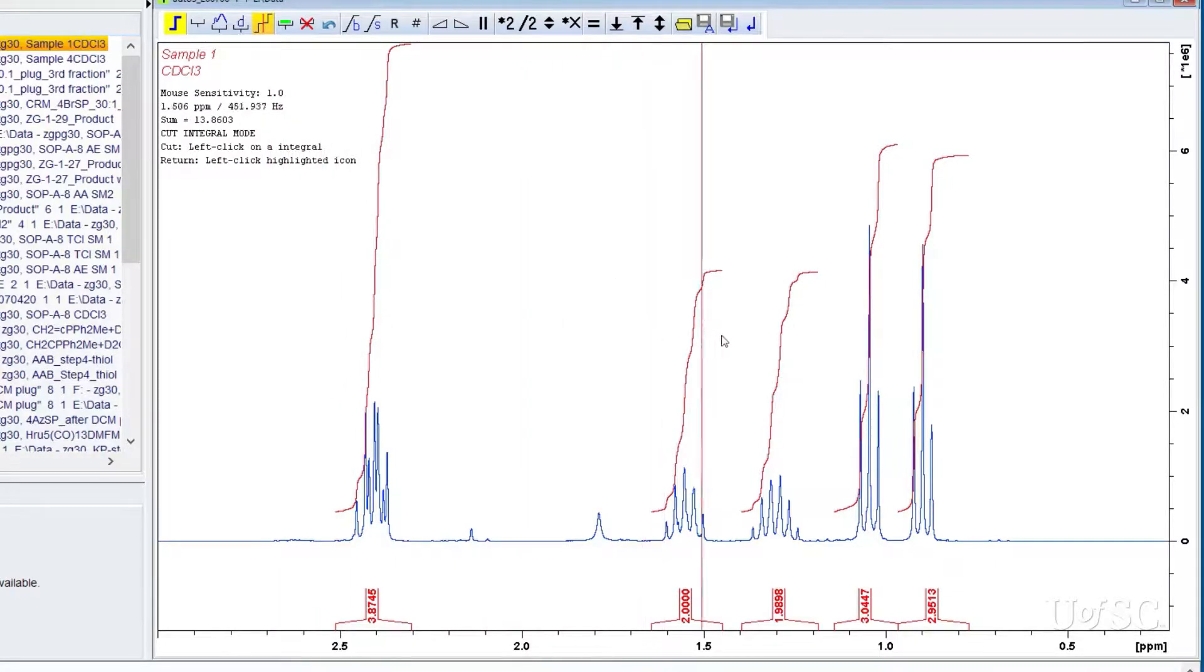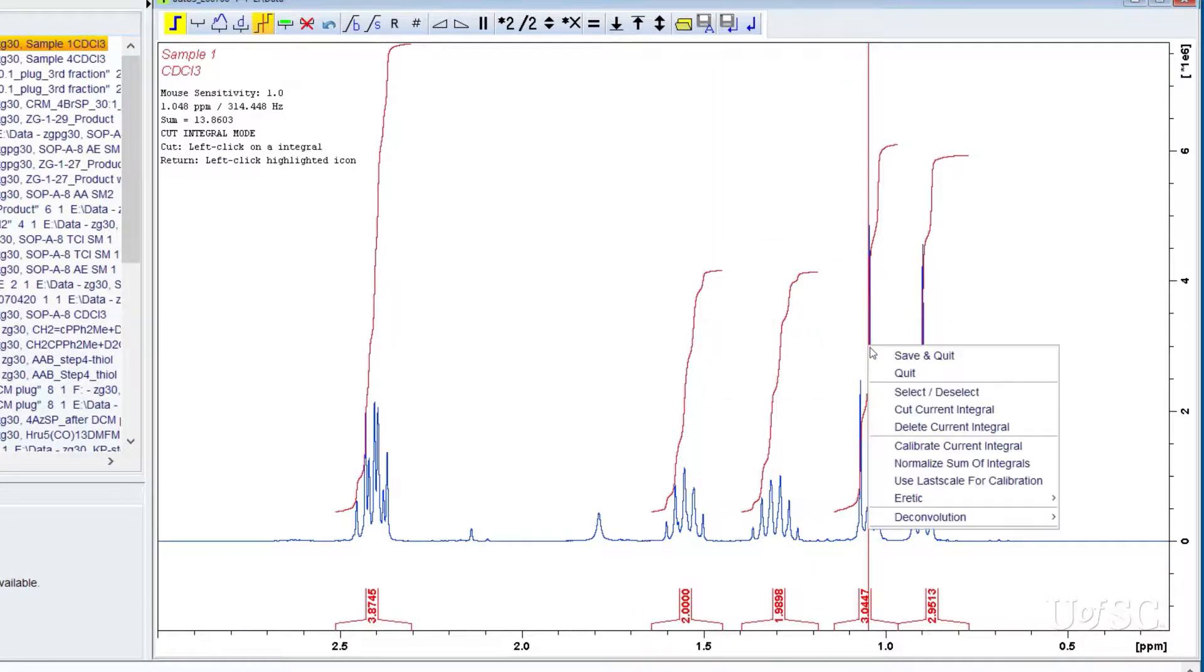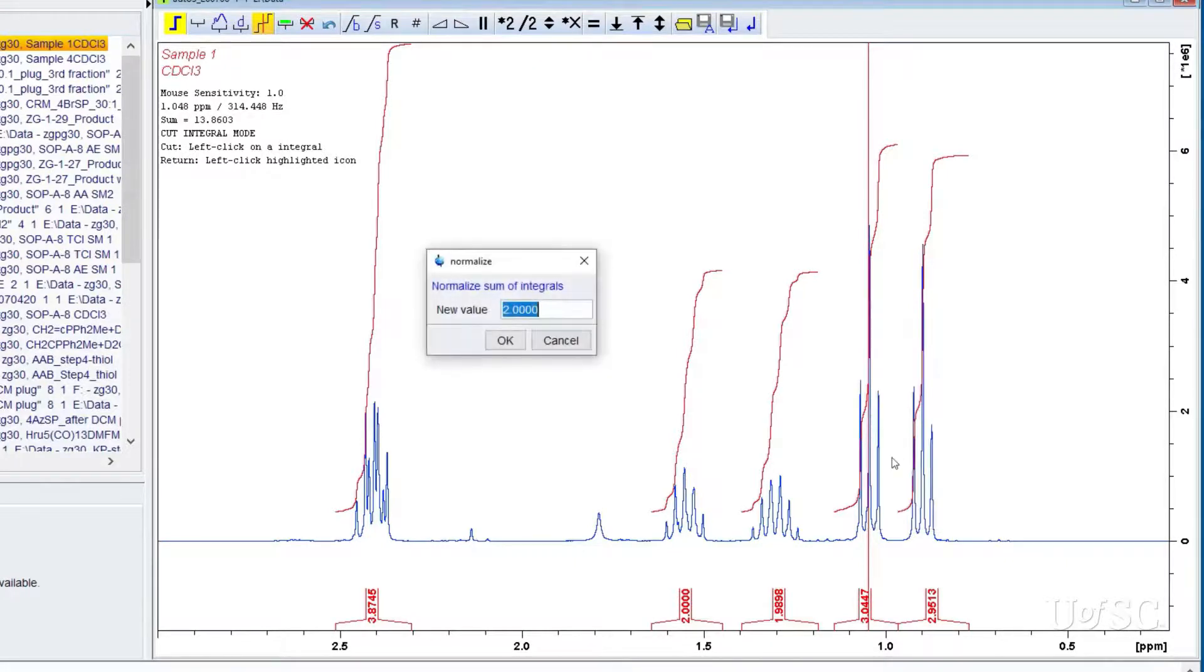In cases you do not know the origin of the peaks, or you are interested in comparing the relative intensities or determined product yields, you can use the normalize function. Move the red cursor onto any region and click the right mouse button. Choose normalize sum of integrals. A dialog box will open. Enter the value. In this case I will set it to 100. Click OK.